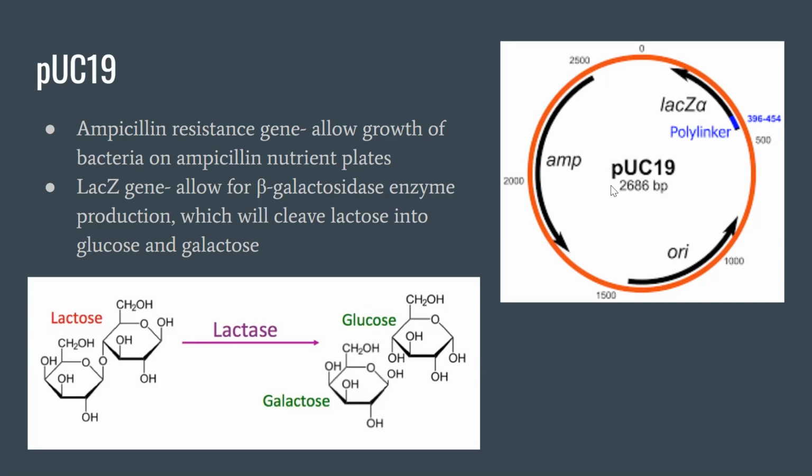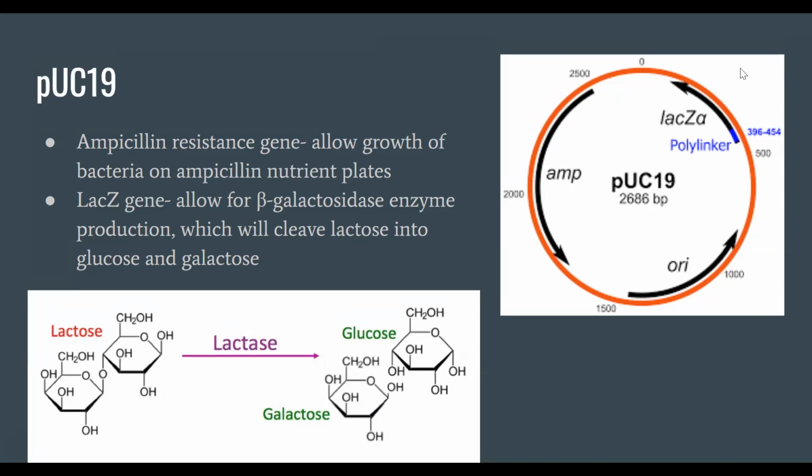The wild-type plasmid, which this is right here. Let me make sure that you can see my cursor, which is right here. All of the cells that are transformed with the wild type pUC19 plasmid should turn blue, because they have an intact lacZ gene. So they'll have the beta-galactosidase enzyme, and they'll be able to cleave X-gal.